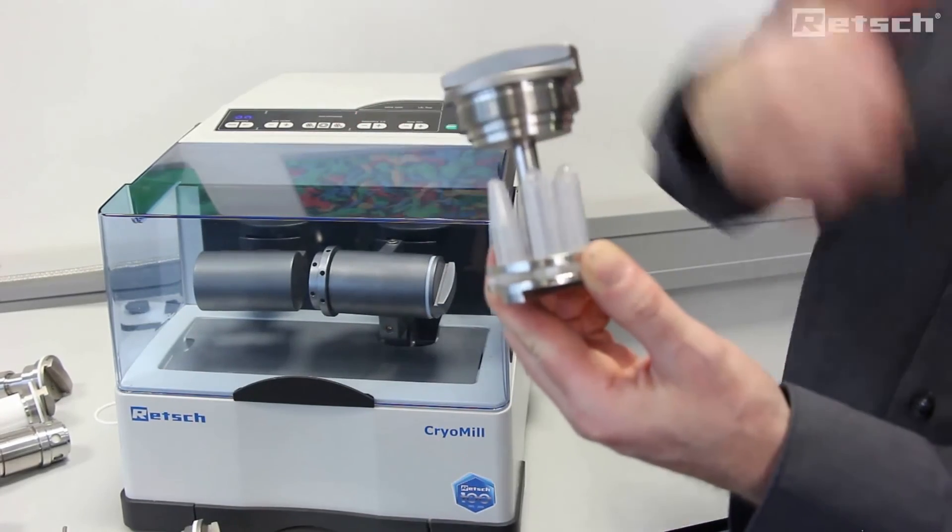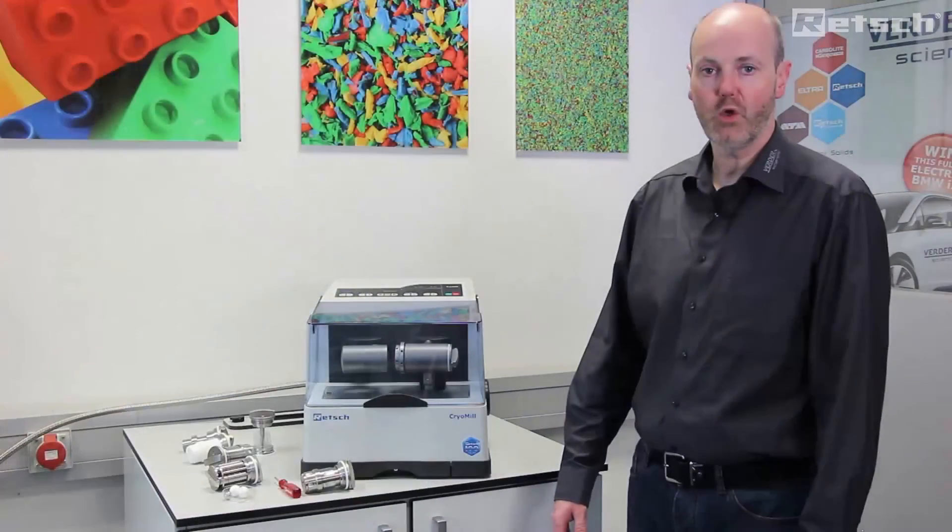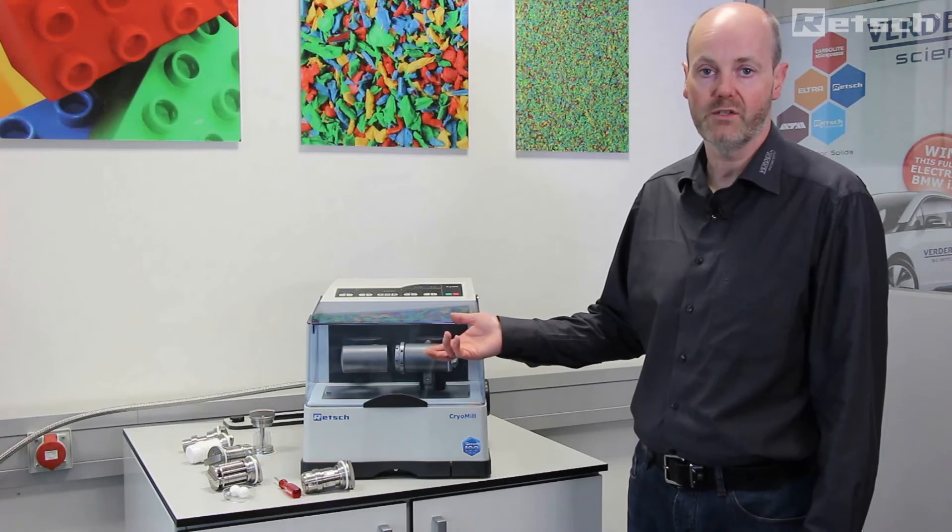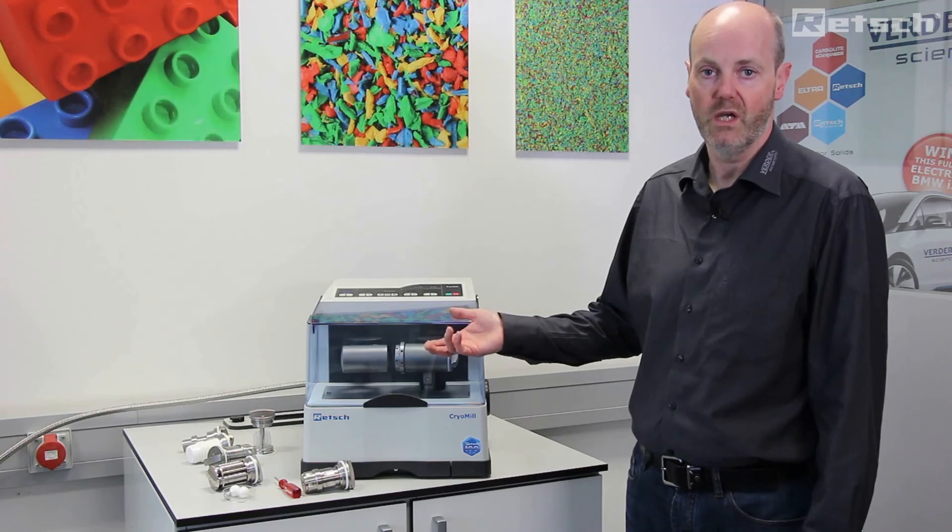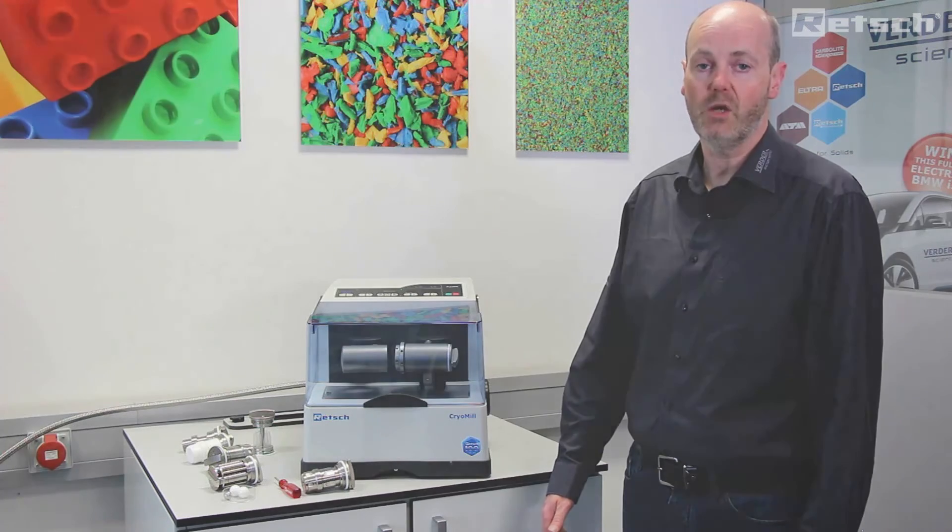I hope the introduction to cryogenic preparation and in particular the CryoMill instrument has been of interest to you. Should you require further details, please feel free to contact our website.